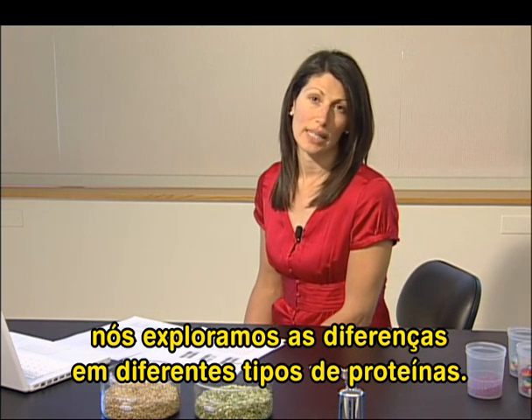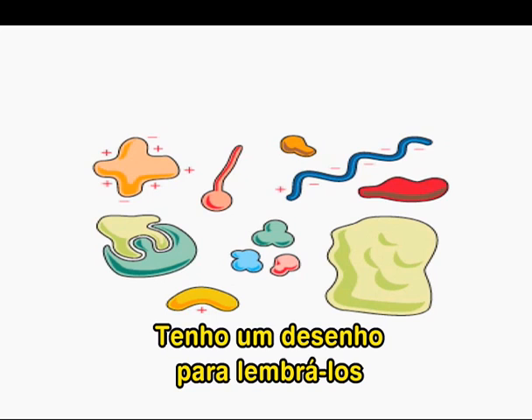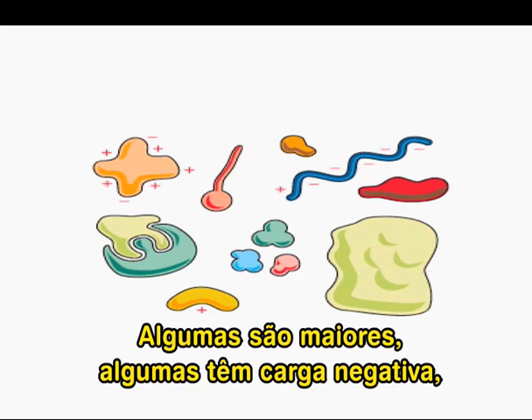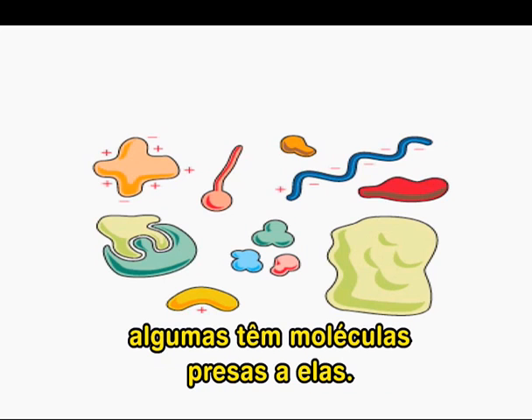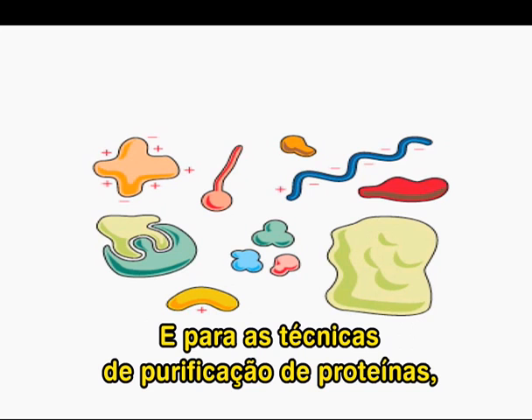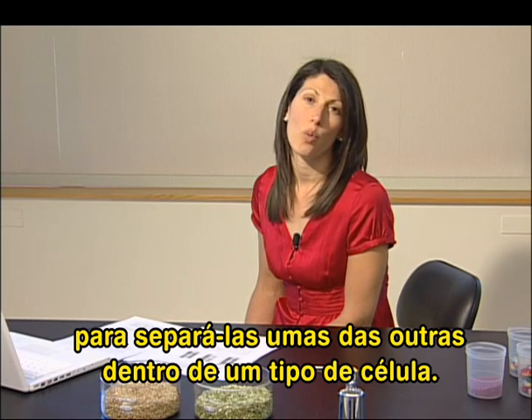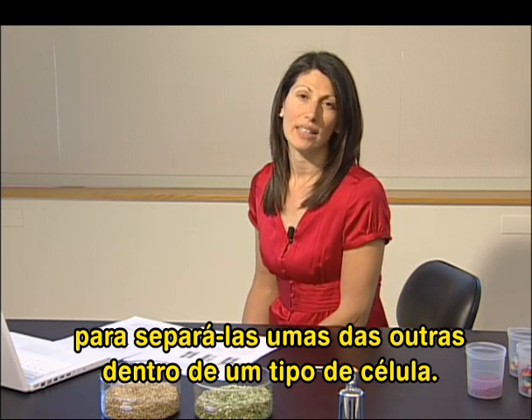different kinds of proteins. So I have a cartoon here to remind you that proteins come in many shapes and sizes. Some are larger than others, some are negatively charged, some have molecules attached to them. And for protein purification techniques, we can use these different properties of the proteins to separate them one from the other within a given cell type.